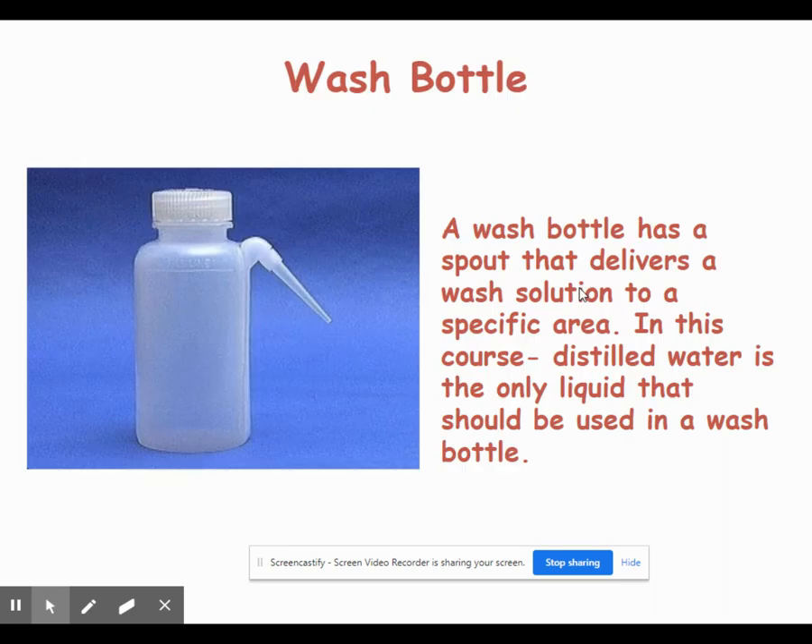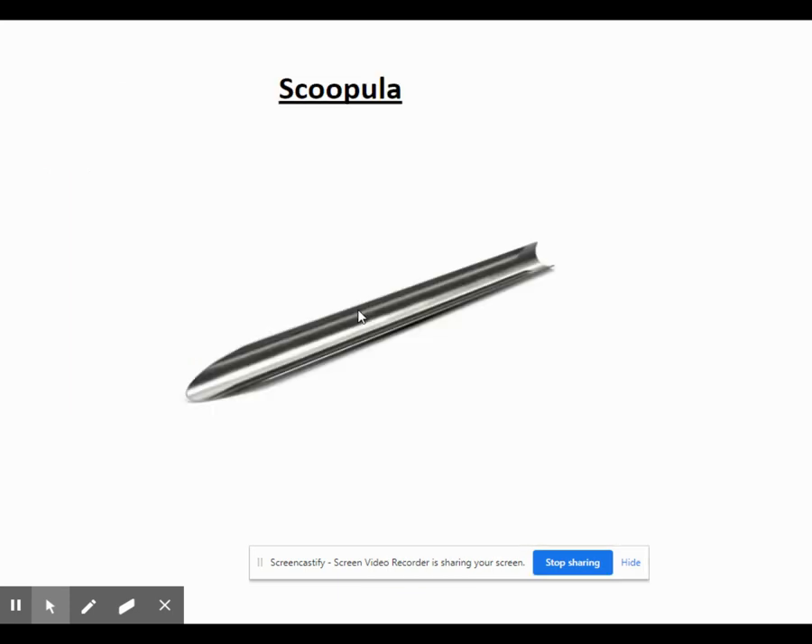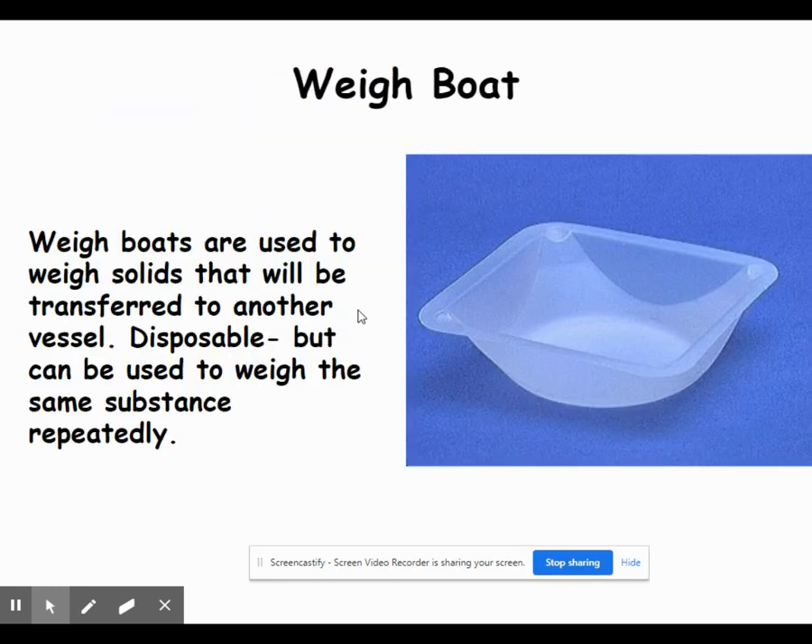Wash bottles are just little squirt bottles — in this lab we only fill them with distilled water, used to rinse things out or add a small amount of water. In higher-level classes you'll see them filled with different solvents. Spatulas are used to scoop out solids and stir things — typically a long, thin piece of metal used to remove solid chemicals from their containers for weighing. If you need a larger amount of chemical, we use what's called a scoopula, which is just a larger, curved version of the spatula.